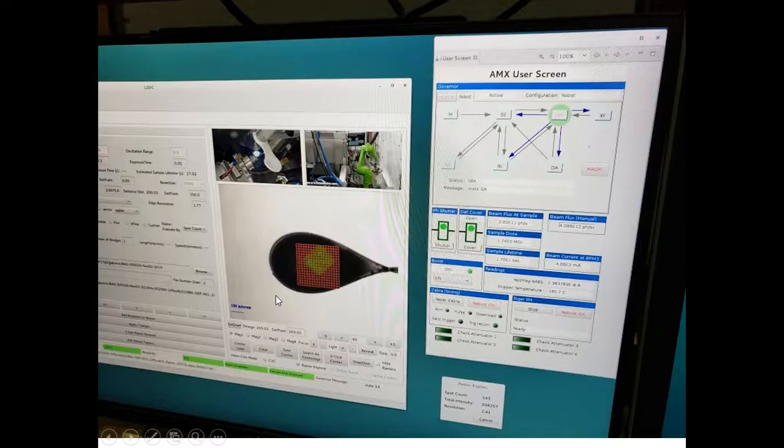Now, what do protein crystals look like in the loop? They look like this. And what we have here is a grid over it. It's known as a raster grid. And this allows us to identify parts of our protein that look like they have good X-ray diffraction data. So the computer actually detects where there's good diffraction after we've hit it with the X-rays, and we're able to identify the structure of the protein.